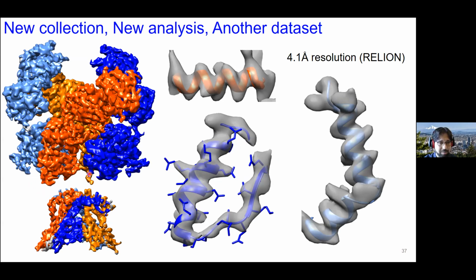And also the linkers that link the ligand binding domain to the transmembrane domain are consistently not showing up in our structure. So it looks like we have an extracellular domain that's just floating in space and a transmembrane domain. Now, if you contour this a lot lower, you see those linkers, but overall, we weren't very happy with this. So we knew we had to stabilize this part of the receptor, the transmembrane domain.